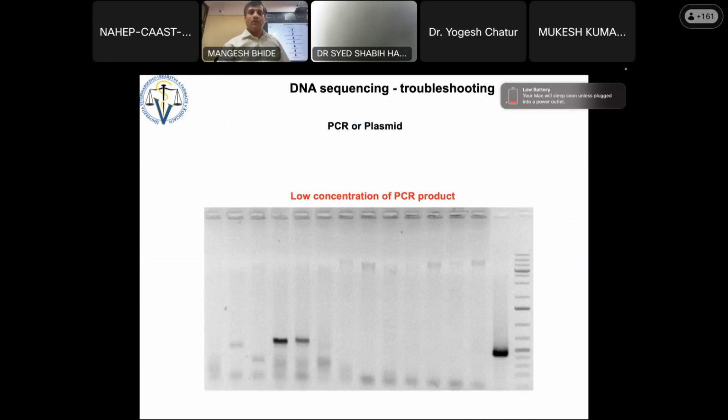Okay. Look, this is your agarose. Right? Yes. Okay, first I will tell how to recycle. I think you will open your own laboratory now.